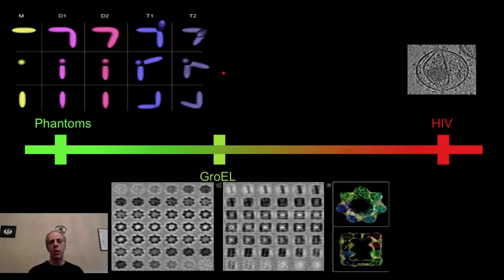And you run your algorithm on that. You know the ground truth because you created it. You hope to reconstruct. Until you don't finish that, you don't move on. So you solve this. You say, great, I put different structures, phantoms I created, I rotate, add noise, add missing wedge, I got them back.